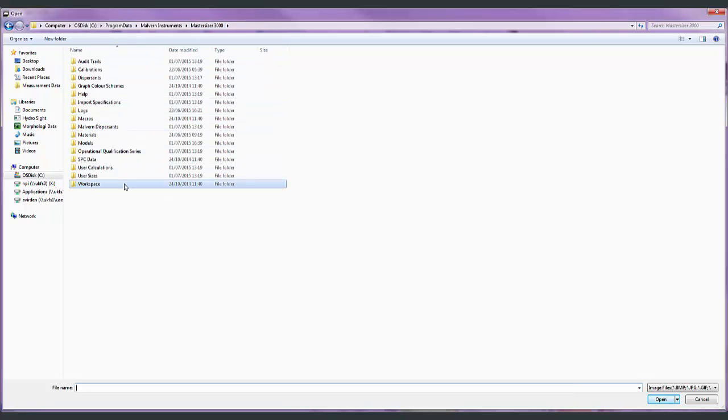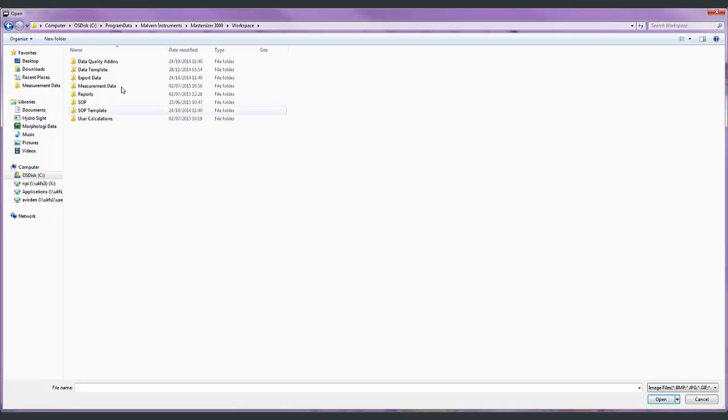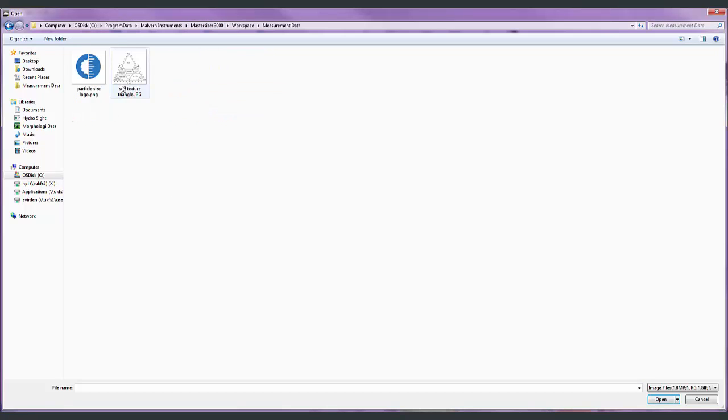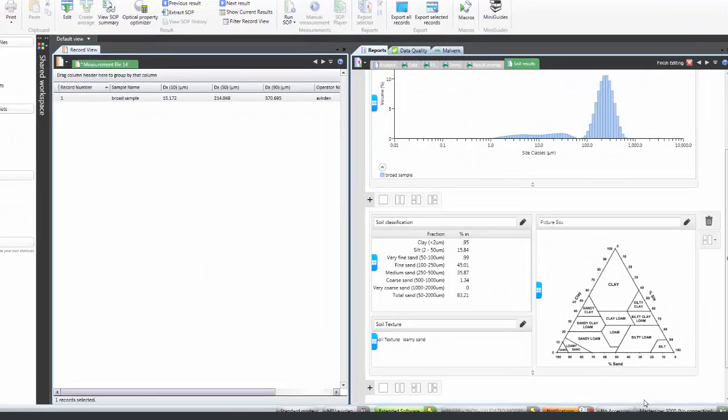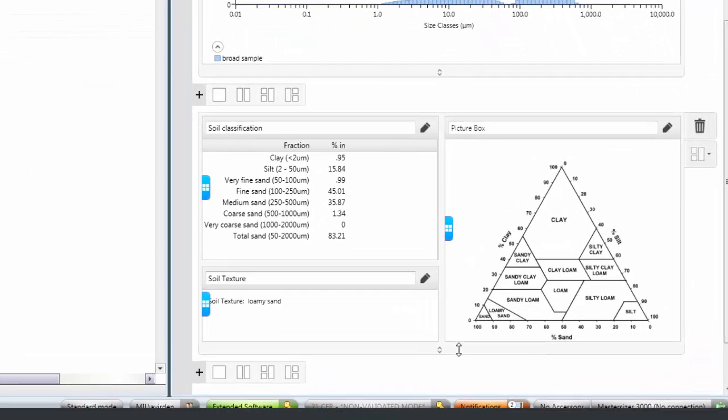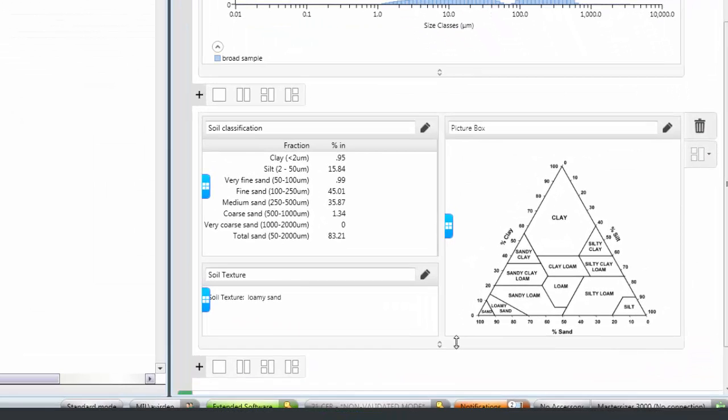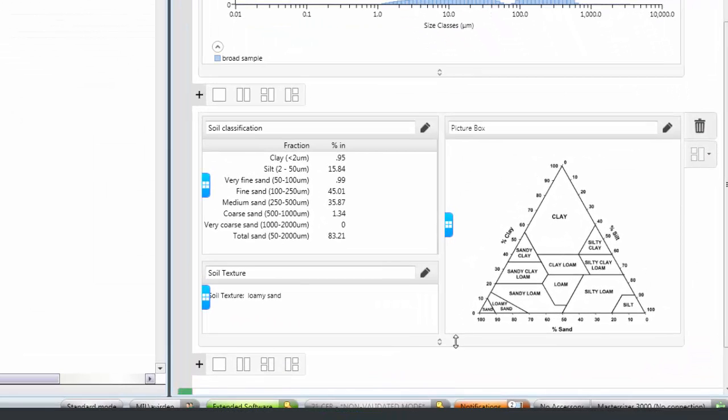In this case what I am going to add is the soil texture triangle, so that I can see where the results of my calculation lie. And again I can adjust the height of these items.